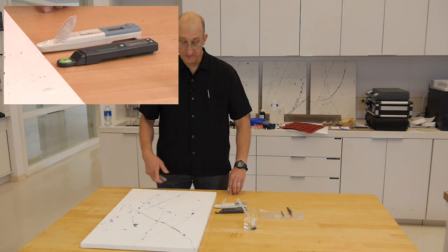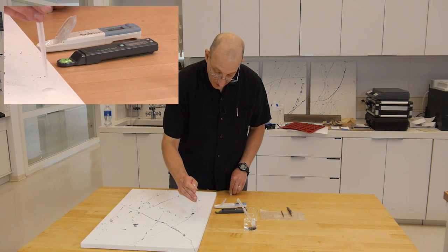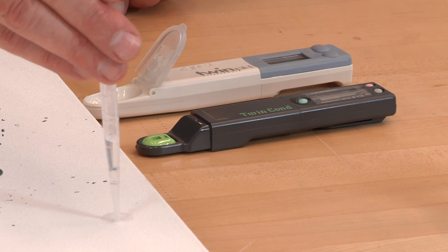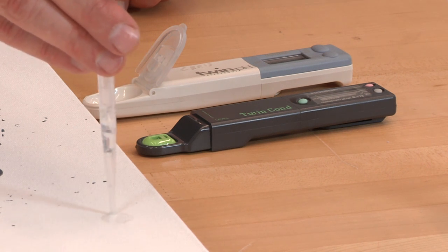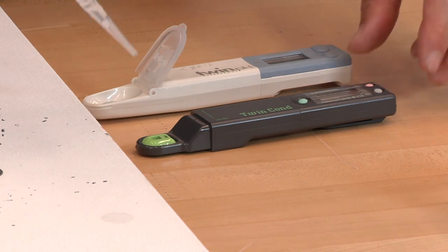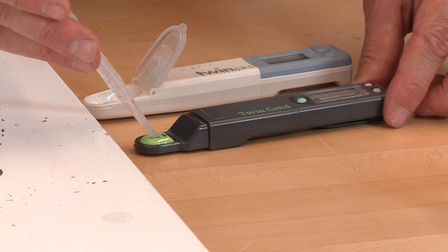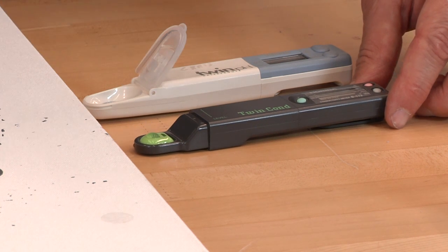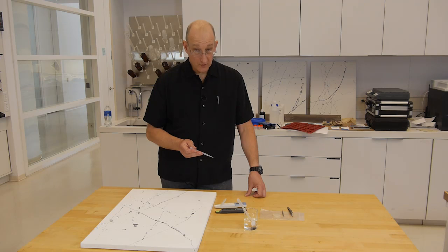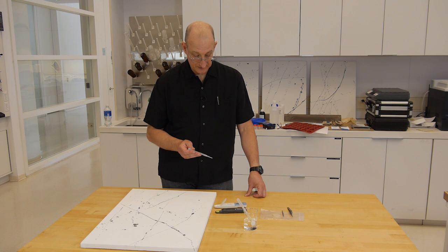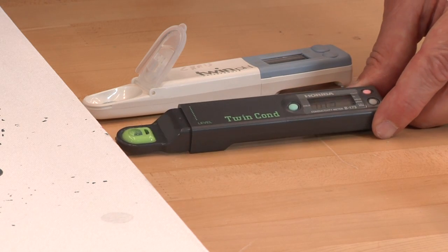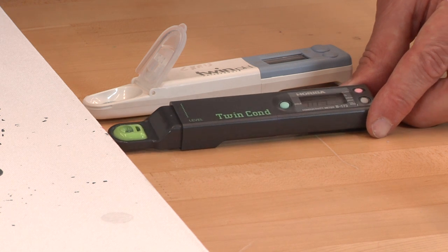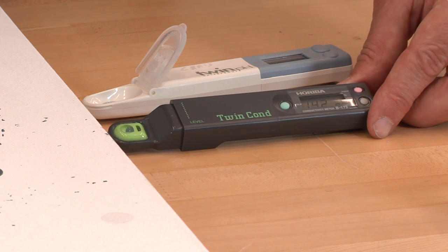It's been a minute now, so we'll pick up the drop of water as best we can, blot the surface, put the drop of water into our conductivity meter, wait for the happy face. And we have a reading of 142 microsiemens.